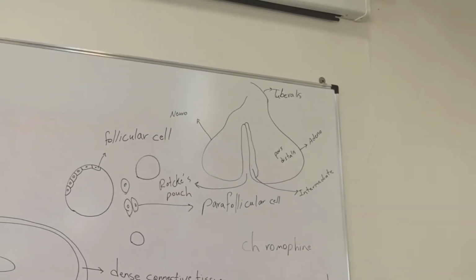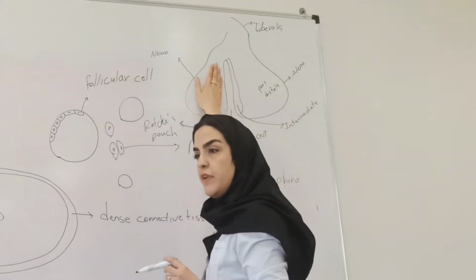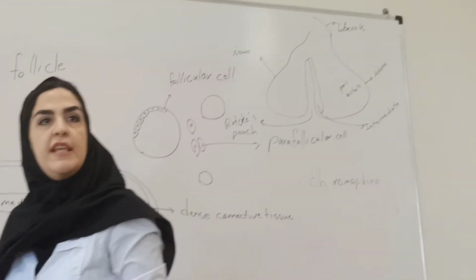Distalis. And these parts are all called adenohypophysis. Okay? Did you understand?